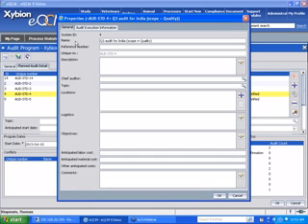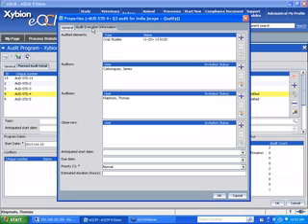So here's just the general information on the plan. It even has some costing, anticipated costs, objectives, logistics. If there's travel involved, you can put that information in, locations, and then the execution information. What are the audited elements? Who are the auditors? Their anticipated start date.